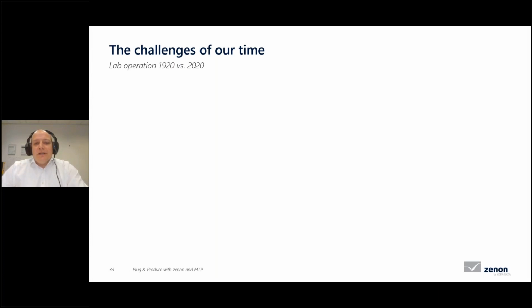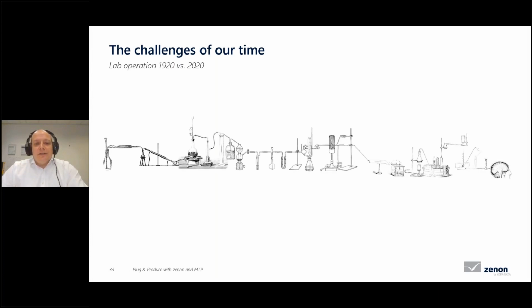Merck's laboratory building houses approximately 120 fume hoods, equipped with laboratory equipment such as pumps, stirrers, dosing modules, chillers, and all that stuff. In the past, tests with different modules have been carried out manually, and later with the use of conventional laboratory control systems, but with a lack in flexibility.